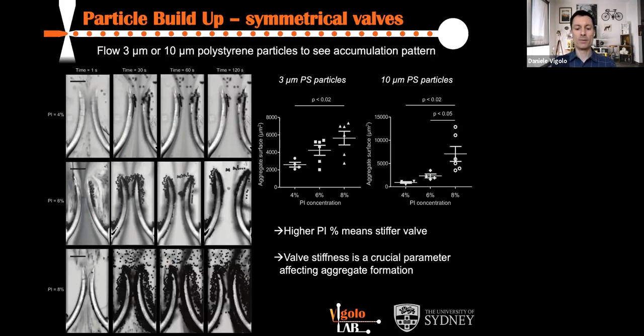Now, obviously, the complaint, if you want, here is the fact that this is just a purely aqueous suspension of polystyrene particles. This is not technically biologically relevant, but the idea behind this was really to point out the hydrodynamic component of this specific accumulation. So what we are looking at here is purely what happens, driven by how the flow moves through these passive valves, and how the stiffness of the valves themselves affects the accumulation of particles.